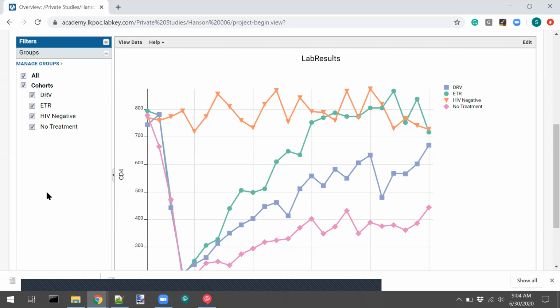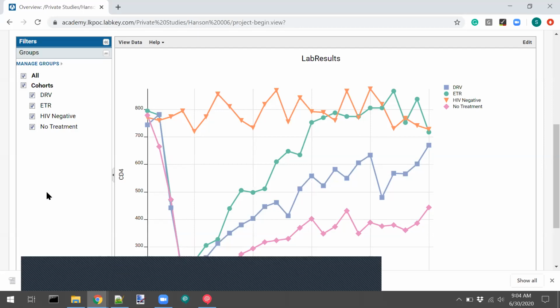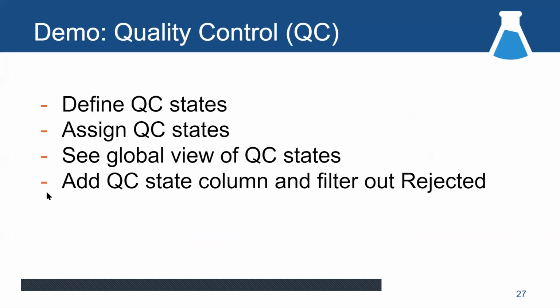Other questions? You just mentioned R there, Steve. Yeah, and the question is, can you install custom R packages into LabKey? Yes, you absolutely can. And again, you can even use RStudio, where you also have control over your custom packages. So yes. Anything else, Jason, before we keep going here? Okay, great. Well, let's keep going. Maybe we'll get back to do some more R stuff at the end if we have time.